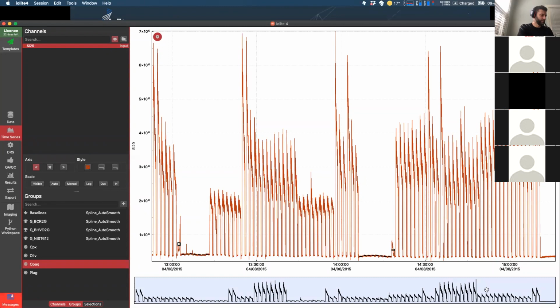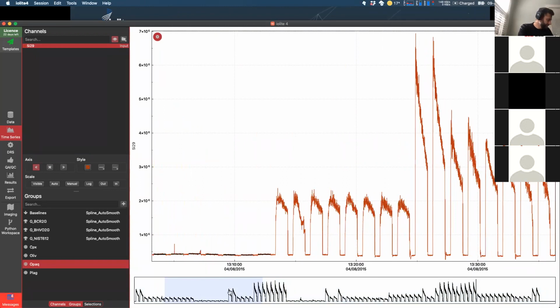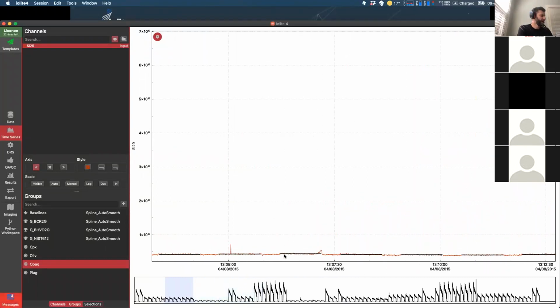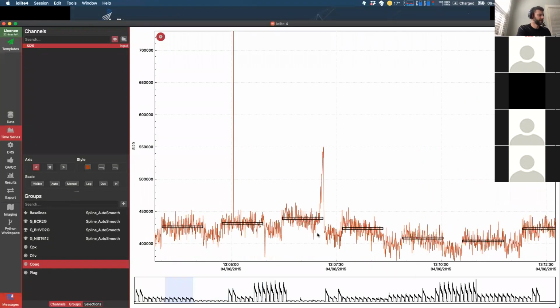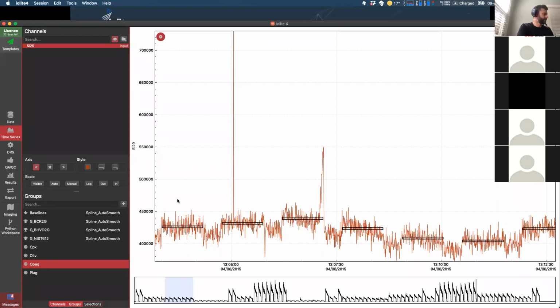But if I was to zoom in, say, on the opaque regions here, so I'm just looking at the opaques, and I wanted to show the max and min of the data that are currently visible, I click on the visible button here. This can be really handy if you're in an area where there is much lower counts, or if it's affected by spikes. So that's what the visible button does there. Auto zooms to the entire data set, and visible zooms to the data that's currently visible.